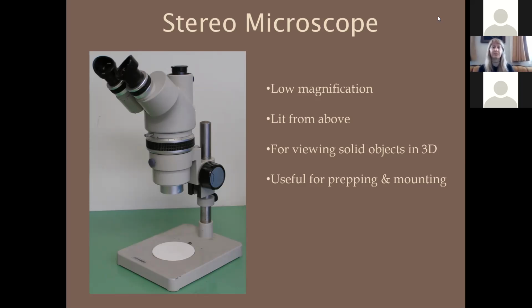And it's especially useful for when you are cutting pieces off your piece of mushroom and mounting slides, making sure that you're getting really exact cuts where you want to go. Or if you are interested in doing like slime mold microscopy. Slime molds are not fungi, but they are a passion of mine as well. And they are really, really, really tiny. And so it can be useful to just look at what are you even grabbing at, because it can be hard to see with the naked eye.